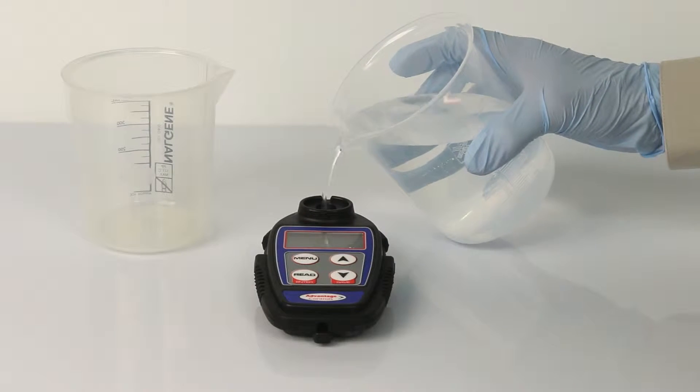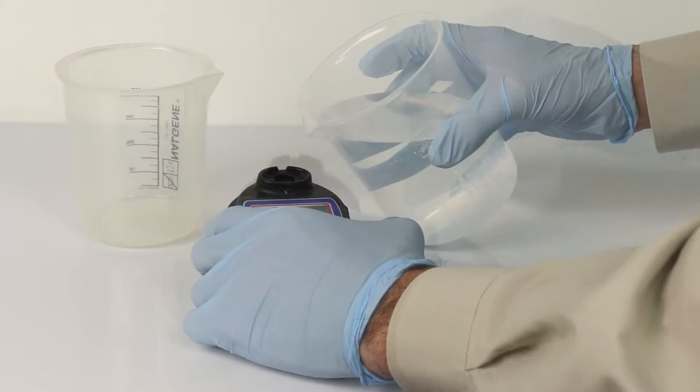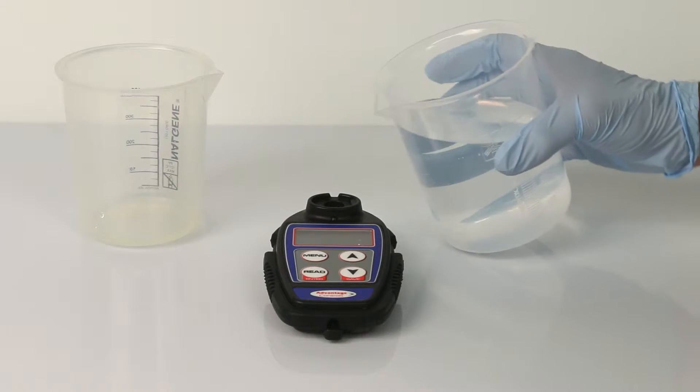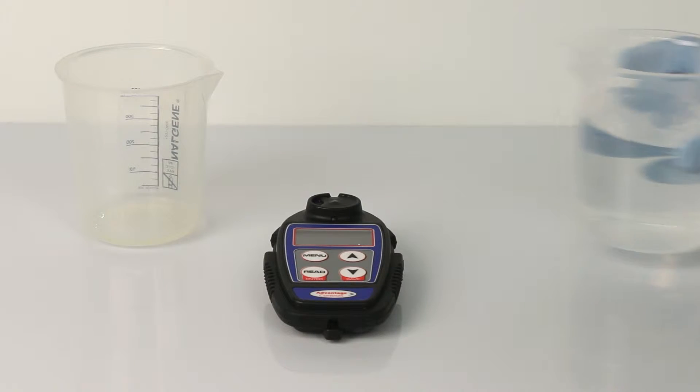Rinse the conductivity cell three times with the sample. Fill the cup with the sample. All four electrodes must be submerged. Make sure there are no bubbles in the cell.